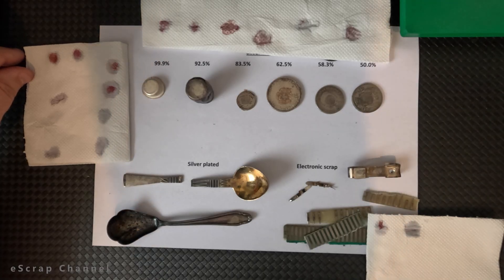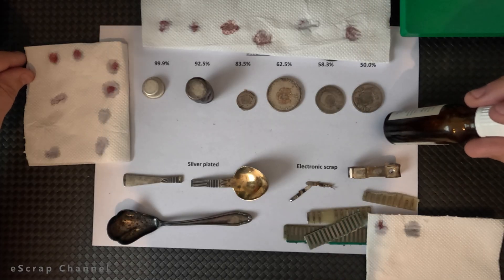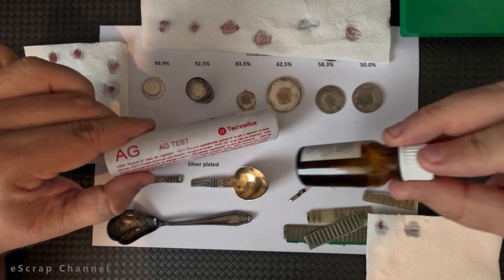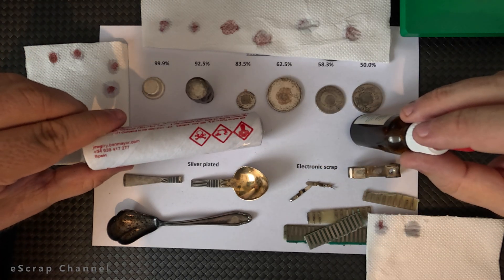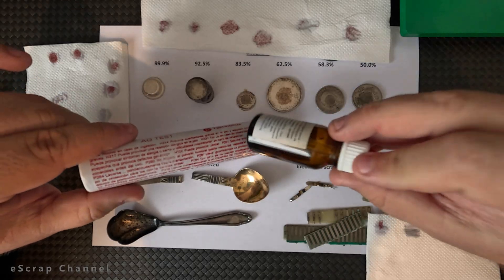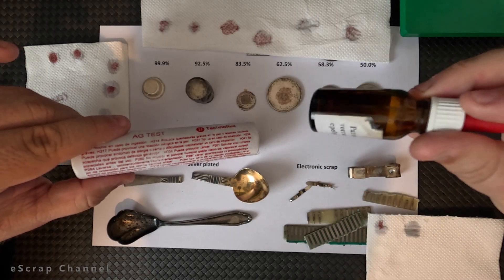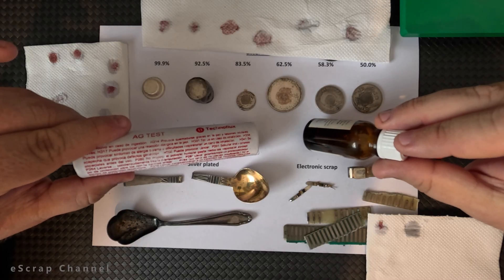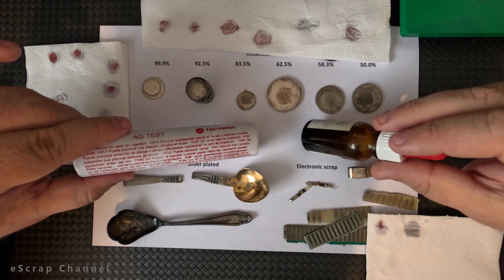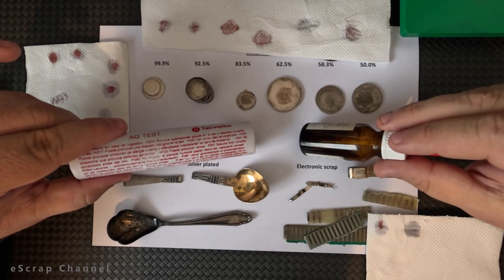Finally, I would like to say that this solution contains nitric acid. It's a commercial product so it's all written here, but you have to be very, very careful when you use it. Read carefully the instructions for use, and in case this goes into your eyes or on your skin, you have to immediately wash your eyes or hands with a lot of water. If irritation continues and you have some medical condition, please consult a physician.